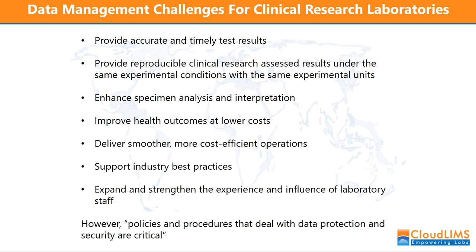Focusing in on data management challenges within the clinical laboratory, there are several considerations. Providing accurate and timely data. If assays are performed in several locations, there also must be a harmonization of processes so that data is comparable and reproducible.